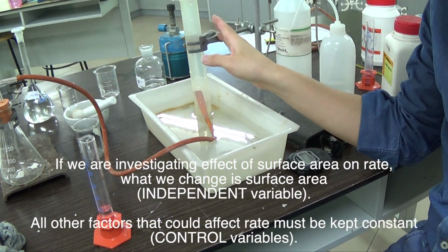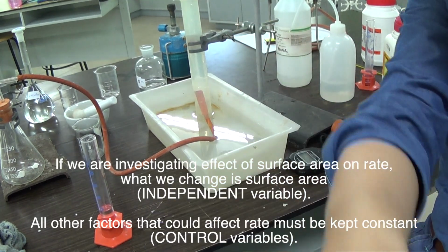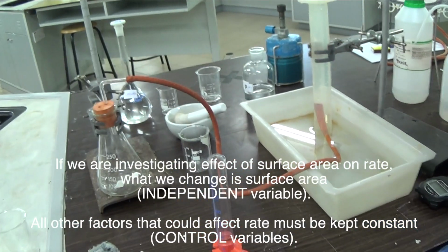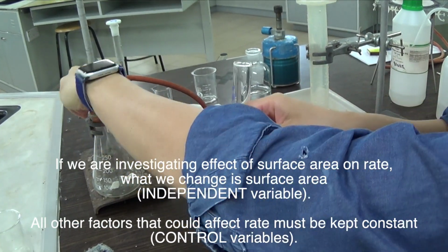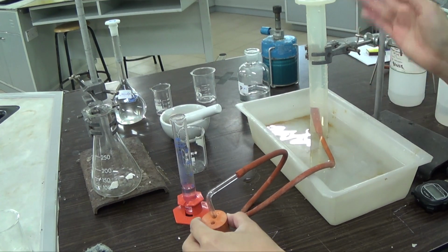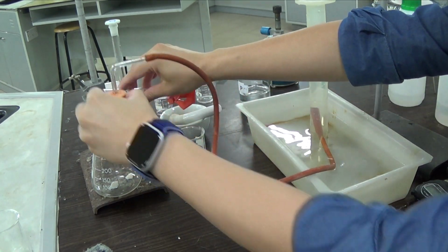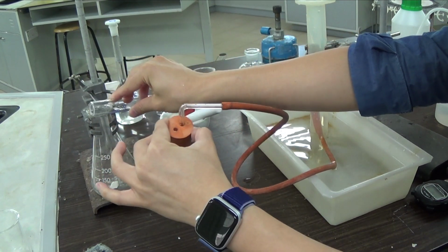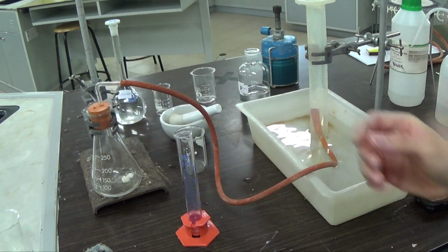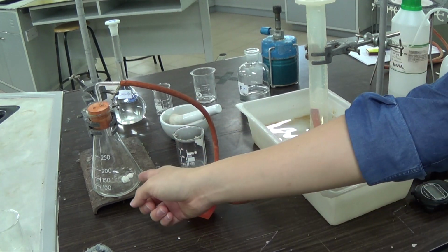Okay, so observe what happened to this measuring cylinder here. Let me just move that slightly further apart, not too sure how well that will appear. So the job really is to put in the acid and then monitor what happens to the gas here. I'll pour in the acid, and the moment I pour it in, I'm going to seal it immediately. As you could see, there is fizziness.